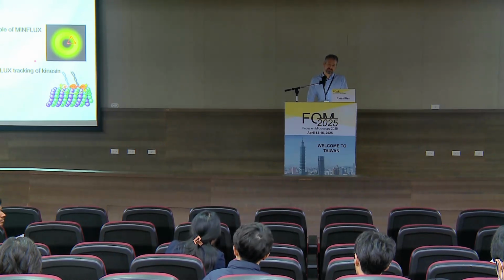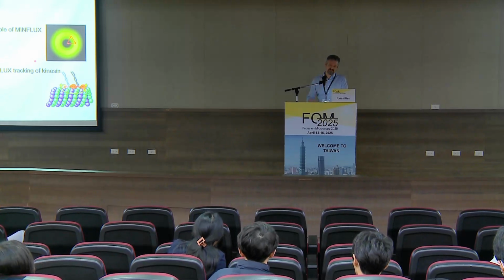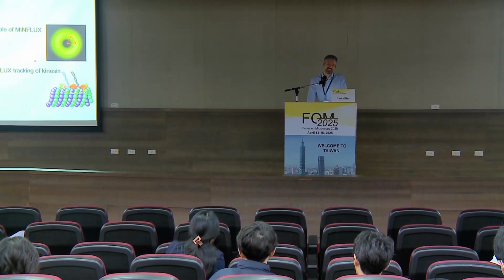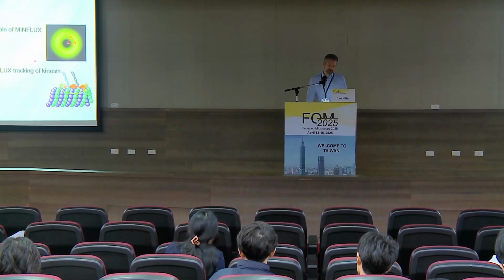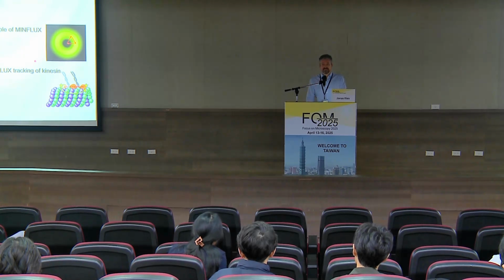So I sometimes feel like I'm shooting in the dark. I see a lot of beautiful dots, but I'm not sure if it's the real signal or some artifact. I still do the kinetic filtering in the post-processing step so that I'm sure that I have proper blinking events over the whole measurement time, but besides that, what controls would you suggest to prove that my signal is the true signal? Yeah, which brings us back to the biology of the sample preparation, which is limiting.